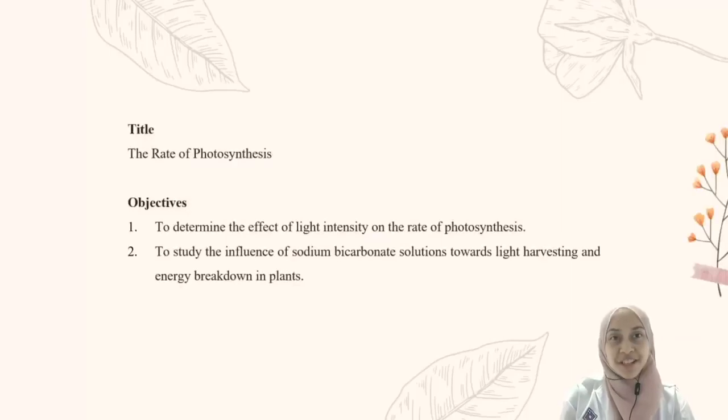The title of this experiment is the rate of photosynthesis. There are two objectives. First is to determine the effect of light intensity on the rate of photosynthesis, and the second is to study the influence of sodium bicarbonate solution toward the light harvesting and energy breakdown in plants.